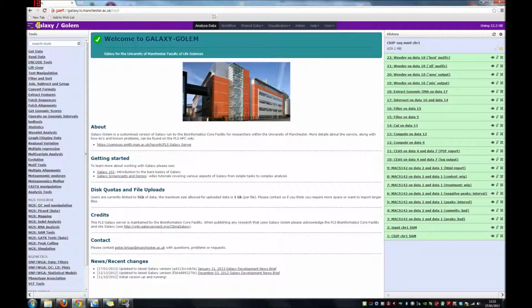What this means is that we can more or less save the flow of data for all these different jobs and create this workflow where we only need to enter a minimum amount of information to make it easier to run again and again. So a workflow saves you time, but it is also something that you can share with other people, which means that they can use your method exactly the same way you did it.